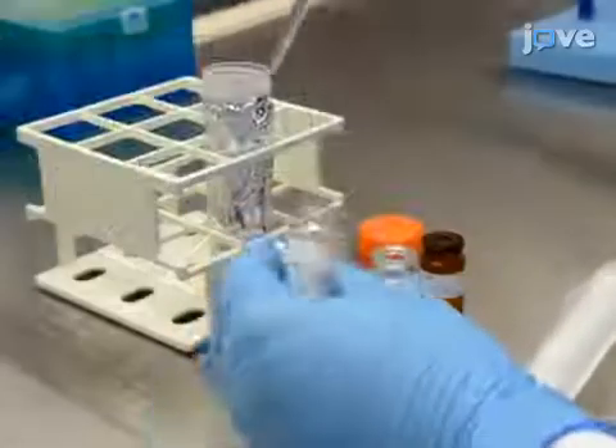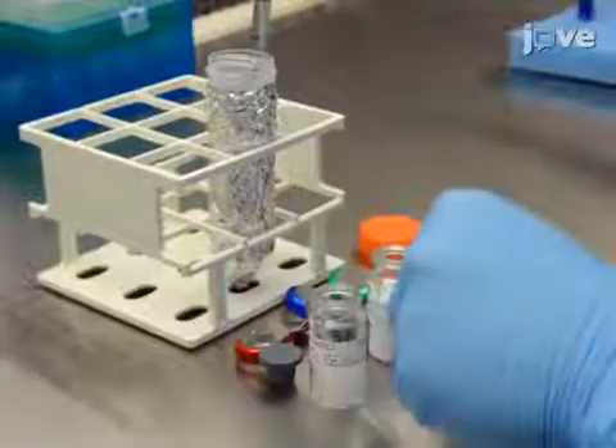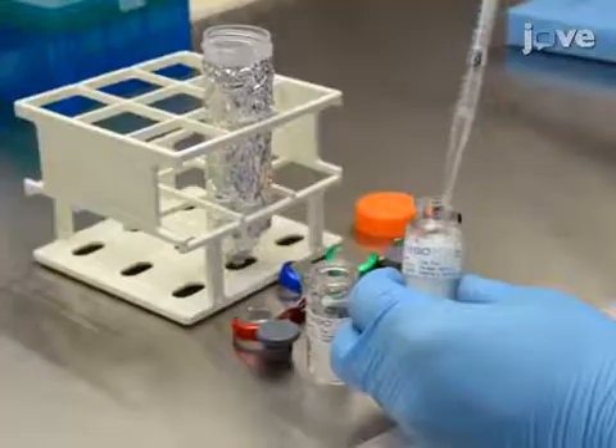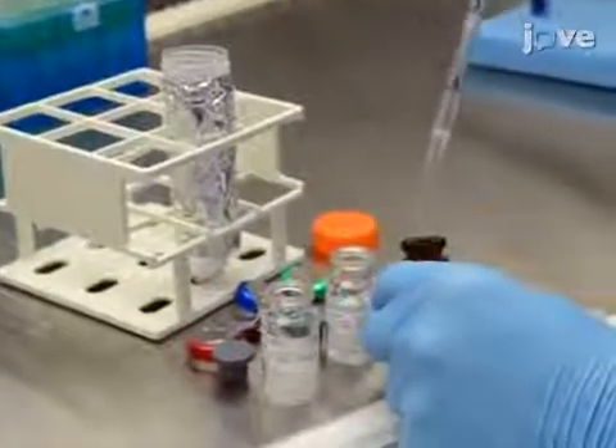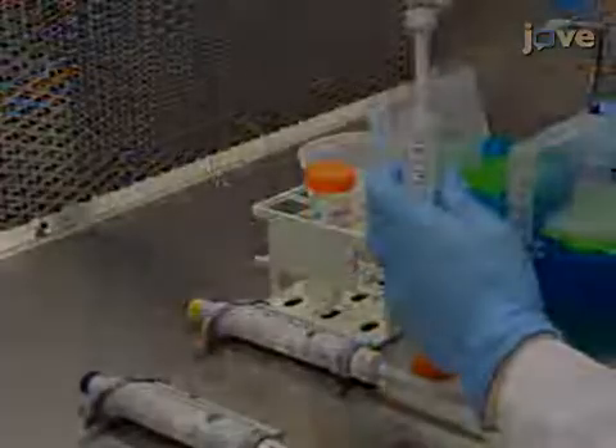To form the hydrogel bioinks, first dissolve the base material components from the hyaluronic acid hydrogel kits into individual aliquots of the water photo-initiator solution. Then, combine the ECM solution.